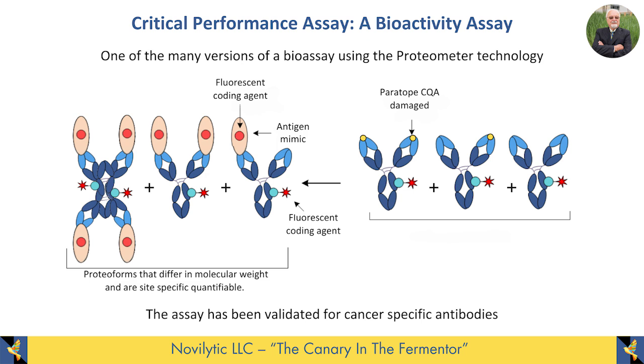Or you might be able to dream up some sort of an assay to do in a test tube. But what you want is to develop a mimic of what would happen in the body if you injected the monoclonal antibody. And the way we do it is in the following way. We take the biological molecule that's inside the cell and see if the antibody will bind to it. But remember, the antibody is in the presence of thousands of other proteins.